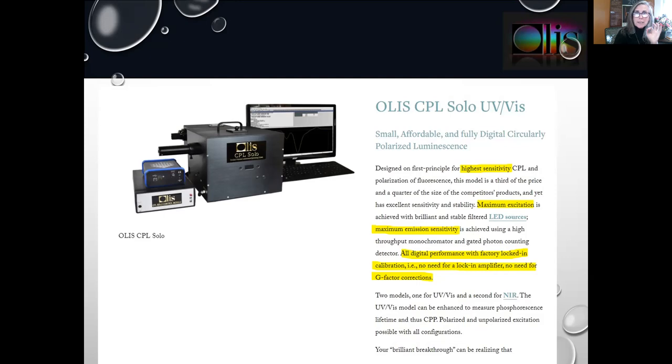I designed our first principle for highest sensitivity CPL and incidentally polarization of fluorescence. This model is a third the price and a quarter the size of the competitor's products, and yet has excellent sensitivity and stability. Maximum excitation is achieved with brilliant and stable filtered LEDs, eliminating the need for a big xenon arc lamp and scanning monochromator. Maximum emission sensitivity is achieved using a small single-grating high-throughput monochromator and photon counting. All digital performance with factory locked-in calibration — no need for a lock-in amplifier or G-factor corrections. We have two models: one for the ultraviolet visible region and a second for the near-infrared region.